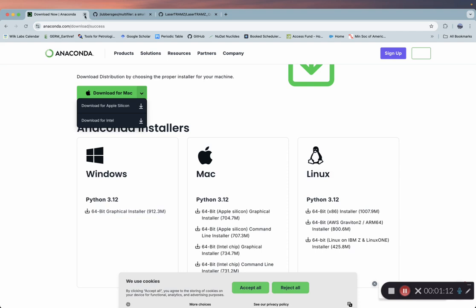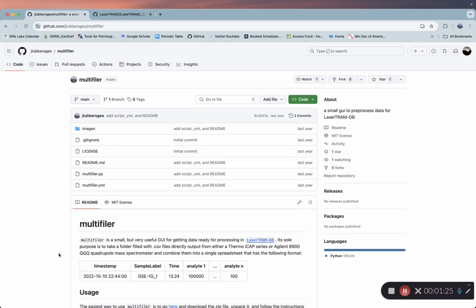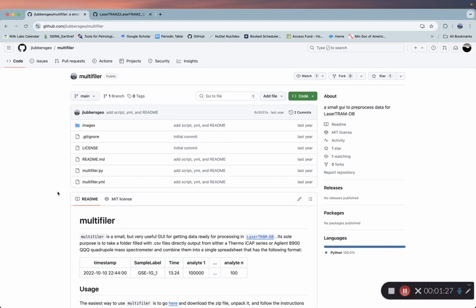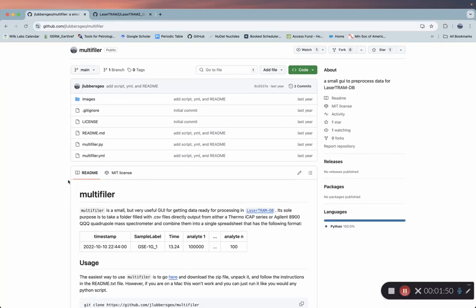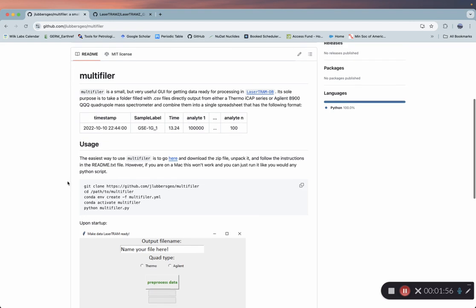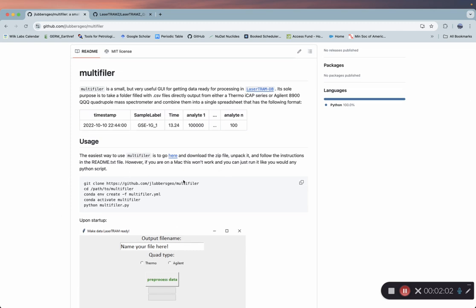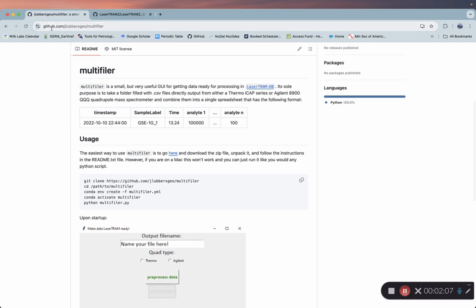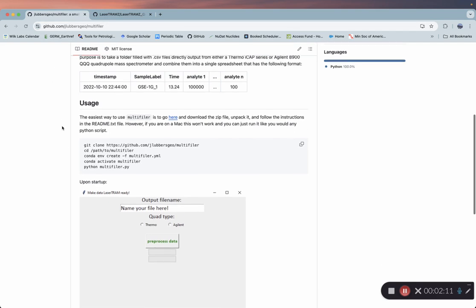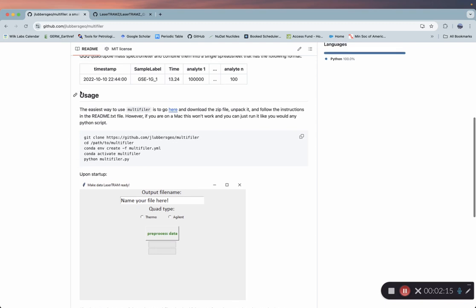Once you're done with that, the next thing we need to do is install the multi-filer. We're going to piggyback off a colleague, Jordan Lubbers. This was written to take all the data that comes off of a Thermo ICAP RQ, where every analysis comes off as its own CSV file, and put them into one large file to be uploaded. This will also work for LaserTramDB, which is a program Jordan wrote to reduce trace element data. The installation is very similar to LaserTramZ, so you can go to github.com/jloversgeo/multi-filer and install it in the same manner.